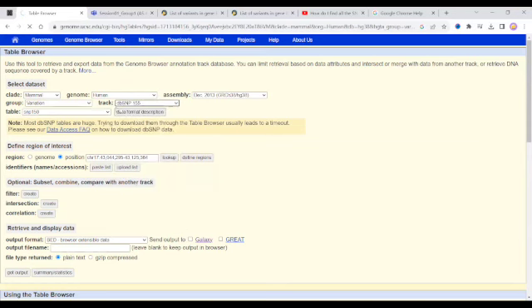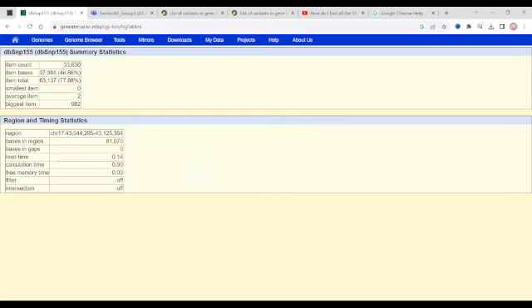Not the common everything here. Not the common all yet. Yep. Already 33,000 variants are found, and this number will keep increasing. But the theoretical limit is about 80 or 90,000 because of the huge size.